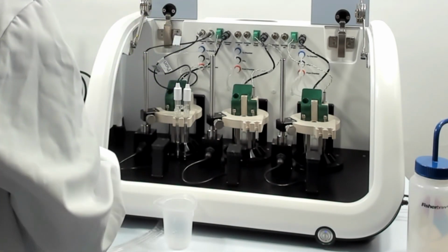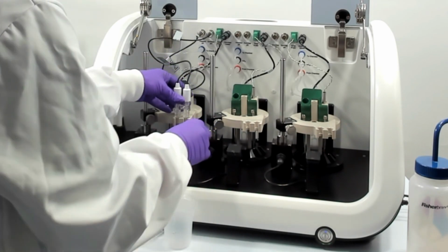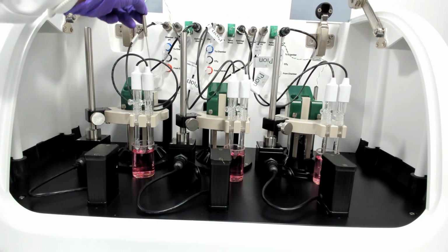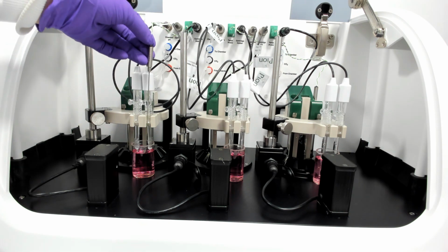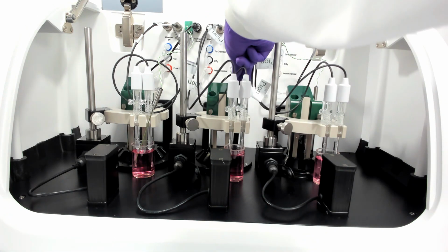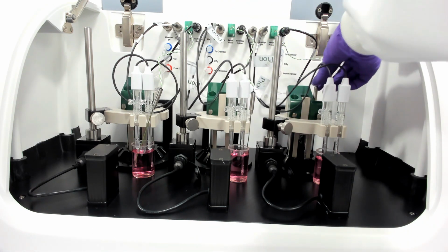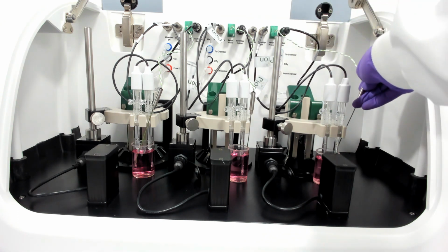The cartridge electrode will sit just at the top of the cartridge to measure the pH at the injection site just upon injection, and this will monitor throughout the assay as well. We want to make sure we put our thermocouple into each of the buffers so that when we're taking the pH calibration, it's all accurate.